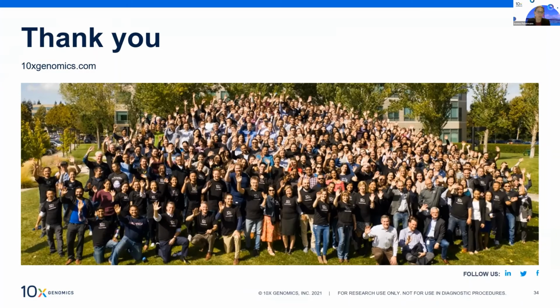So you do perform sectioning on a standard glass slide. So really there is no stress involved. And then you load this up on the Visium, on the Site Assist that has loaded a Visium slide onto it. You pick the area that you're interested in transferring onto the slide. And within the instrument, it basically pairs two of your sections with a Visium slide, and we actually already capture the RNA transcripts inside that instrument.